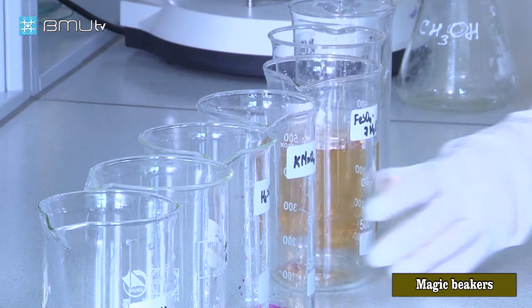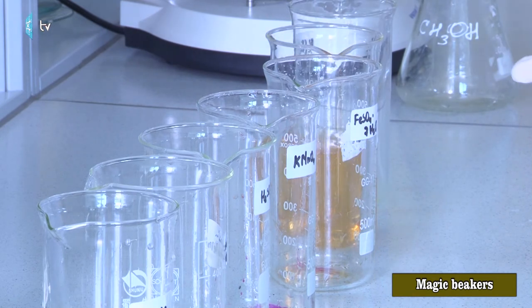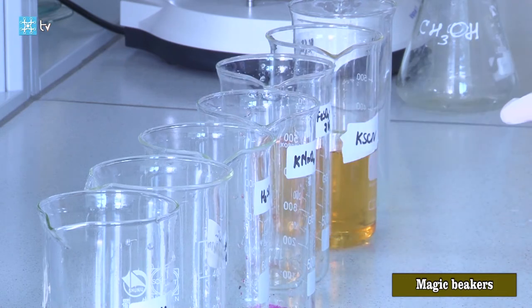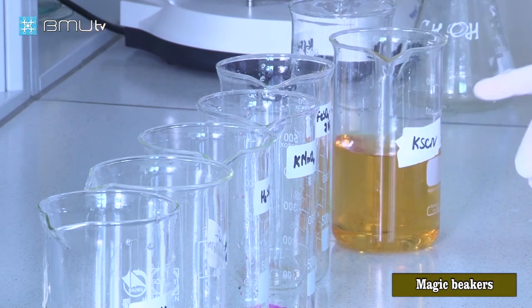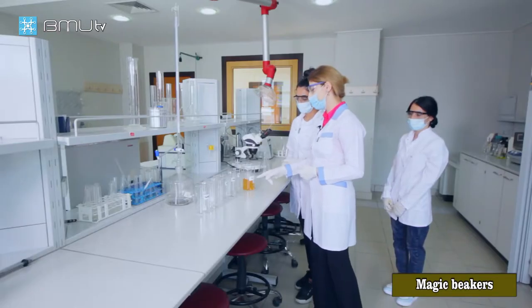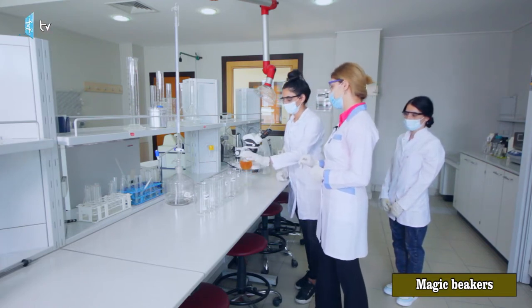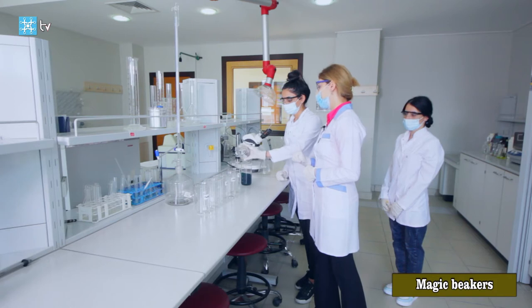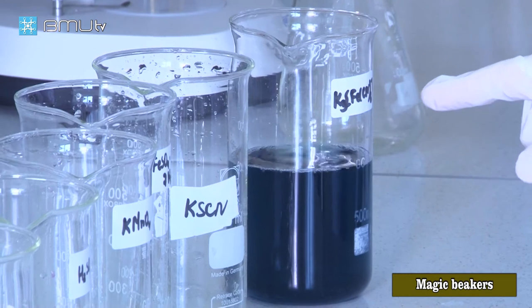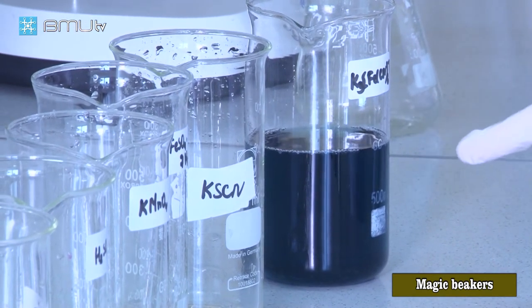In the sixth beaker, we have potassium thiocyanate. That's why we get orange color, and iron is oxidized from 2+ to 3+ ion. In the seventh beaker, we have potassium ferric cyanide, and we get a blue color solution.